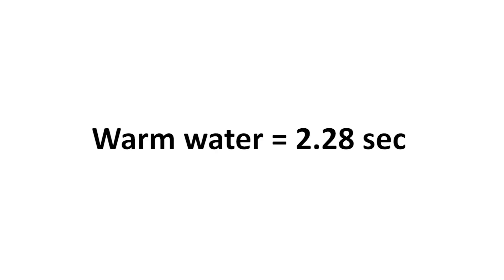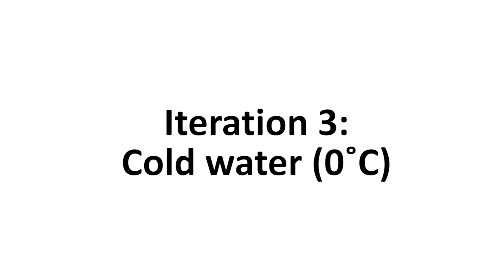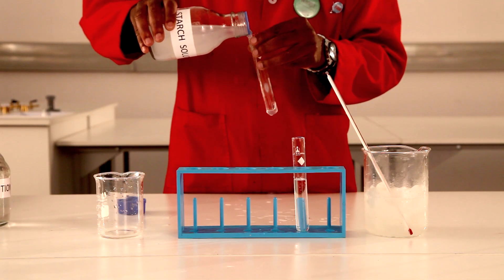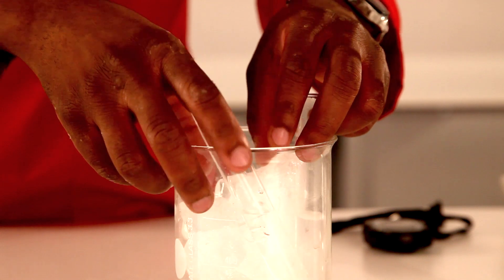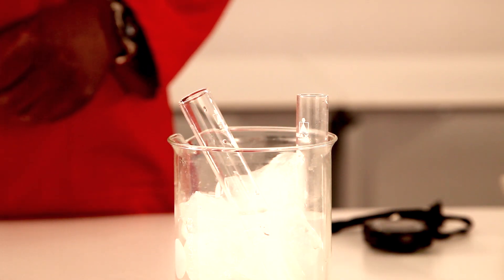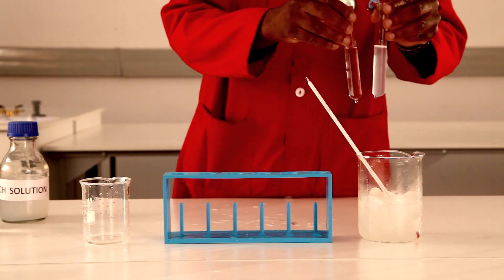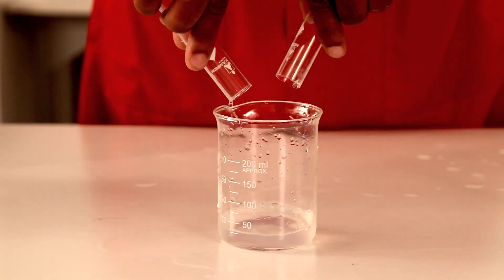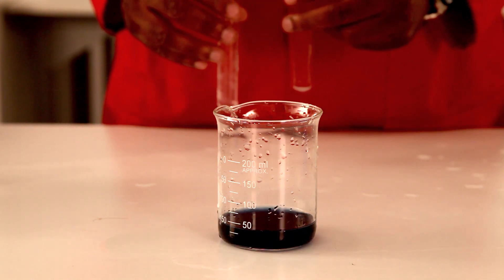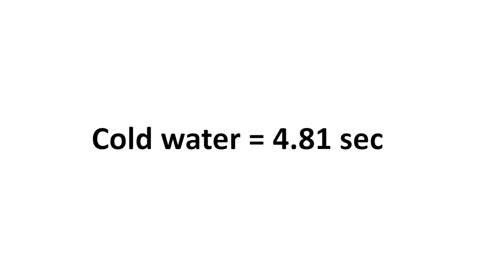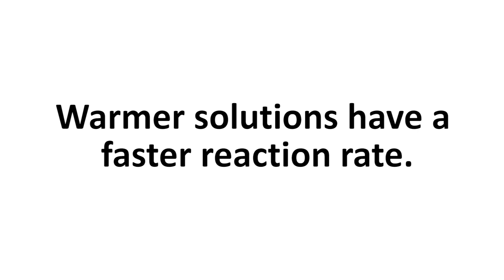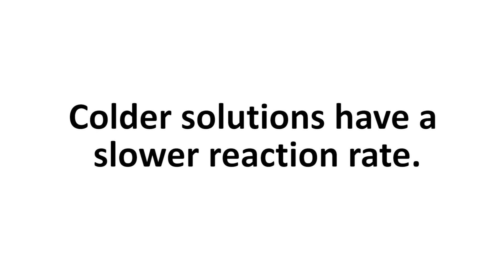The reaction time was 2.28 seconds for the warm water solution. Iteration 3: Cold water. Pour 10 cm³ of iodine and starch solution into separate test tubes. Place the test tubes in a beaker with ice, allowing the contents to cool down to zero degrees Celsius. Pour the contents of the test tubes into a 250 cm³ beaker and with a stopwatch record the time elapsed from mixing the solutions until it turns deep blue. The reaction time was 4.8 seconds for the cold water solution. Notice that warmer solutions have a faster rate of reaction and colder solutions have a slower reaction rate.